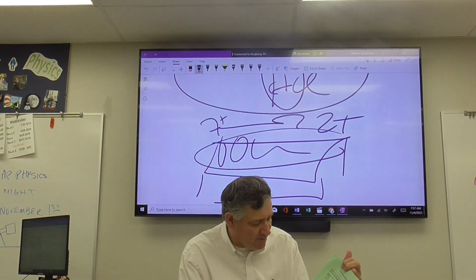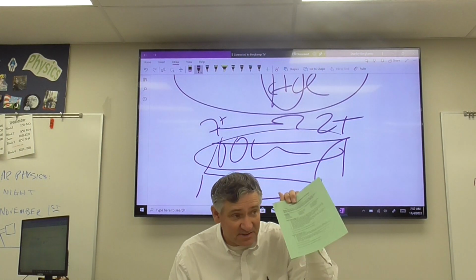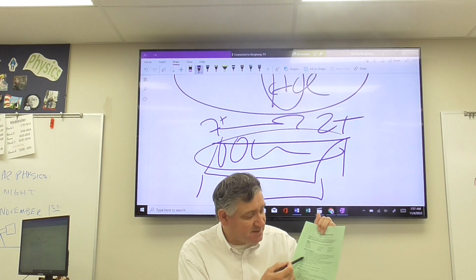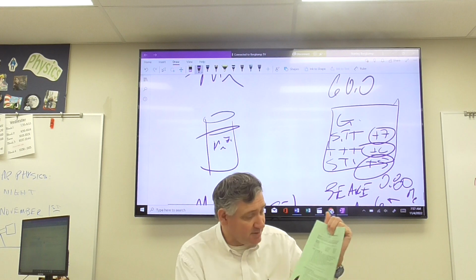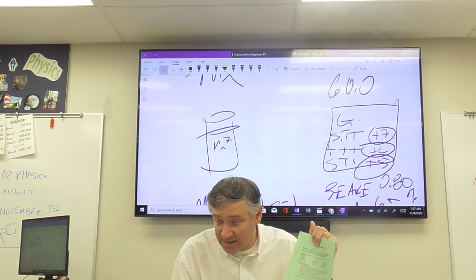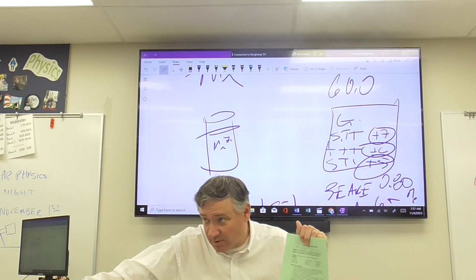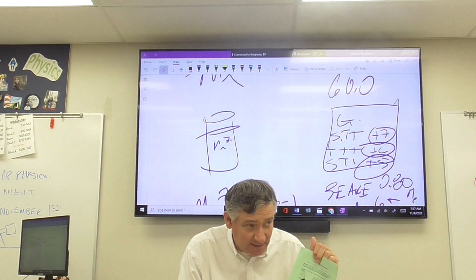When you prepare this 100 milliliter beaker, this very first thing that you're going to do is the one that has to be right. Because if this beaker, the first thing that you need to label, a beaker that says 0.1 molar potassium permanganate, is wrong, everything else that you're going to do with that is going to be wrong. So this is something that you're going to keep going back to again and again and again.